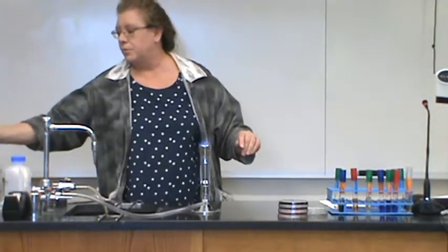Okay, so that is inoculated. So now you're finished with this swab, so go ahead and discard it in the proper disposal bin. So you have inoculated now your 3 selective and differential medias.